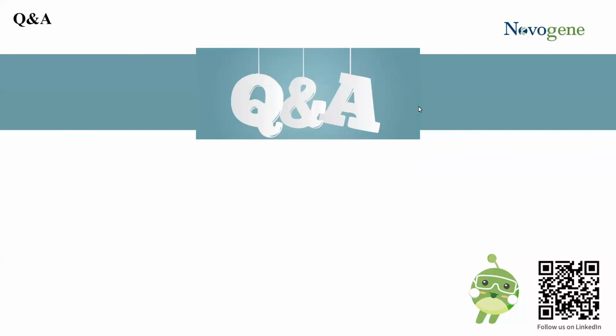Abhi, there is a question from Mickey around the question of Trizol. Was that recommended? And is there an extra fee for samples extracted using Trizol? Could you speak to that?